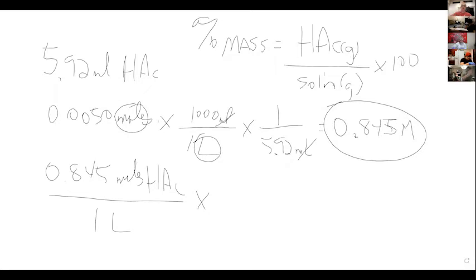All right. So 60.052. All right, I was off by a hundredth of a gram. Sue me. Over 1 mole.